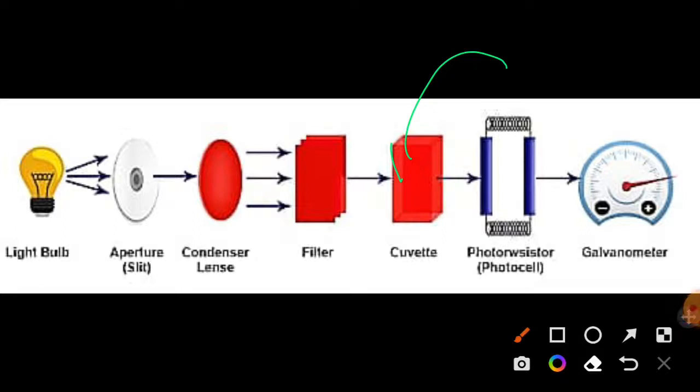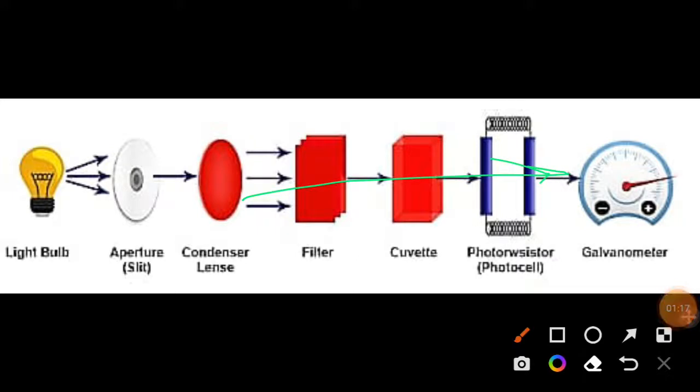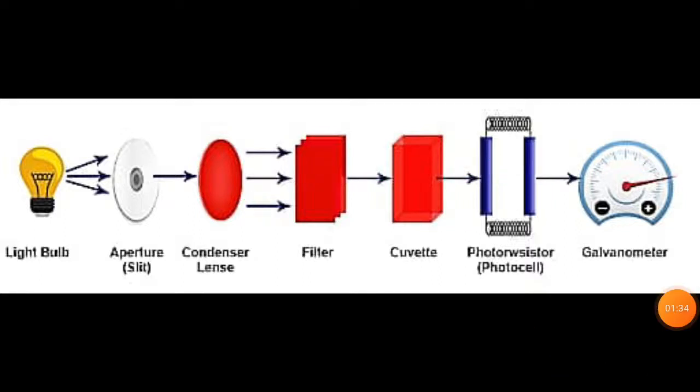The idea is, whenever we are measuring the OD of any kind of bacterial culture, we can do this with the help of turbidity. But in the case of DNA and protein, there is no such difference with which you can distinguish them visibly.